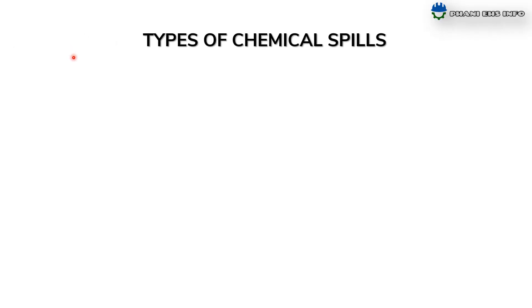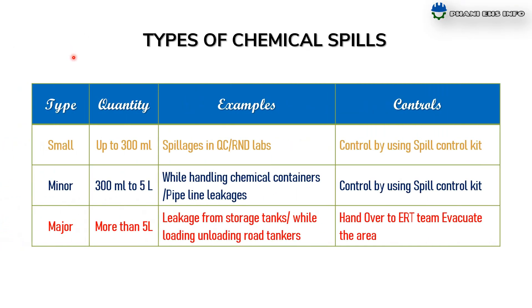Types of chemical spillages. There are 3 types of chemical spills: small, minor, and major. Small spills means up to 300 ml. Examples include spillages in QC and R&D labs. It is controlled by using the spill control kit.